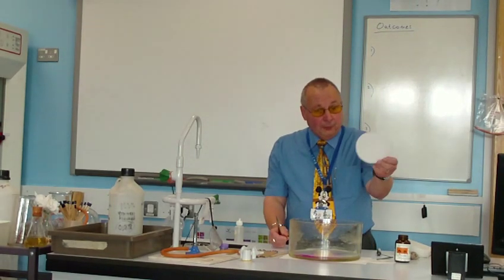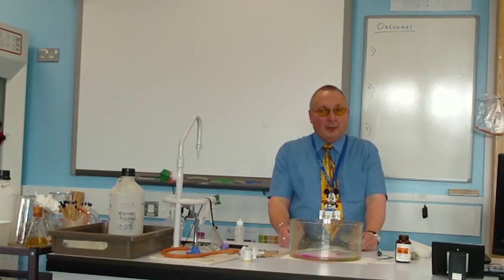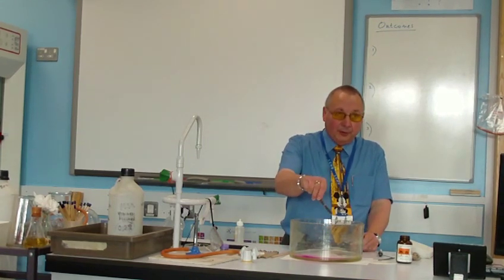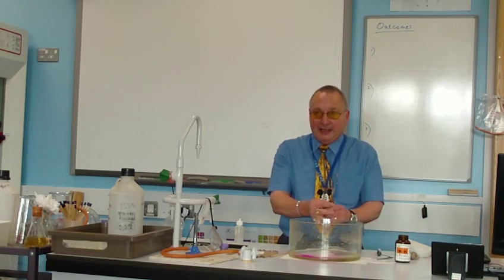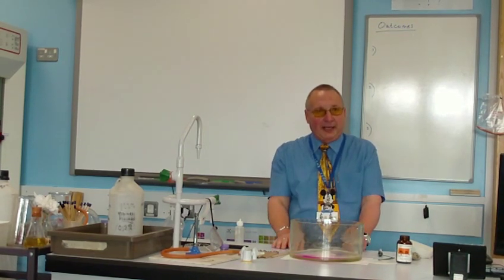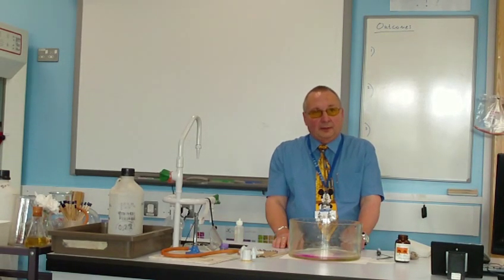Now, what I'm going to do is the same experiment again with sodium, but I'm going to float it on the water. Now, that stops the sodium moving around a lot, so more of the heat from the reaction stays there. And if more heat stays there, hopefully, what did I say the bubbles were?